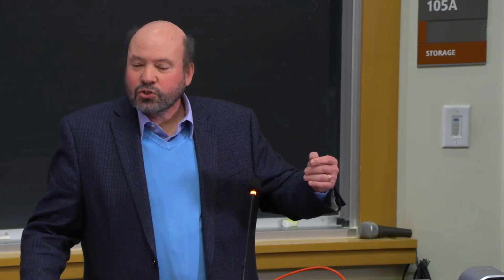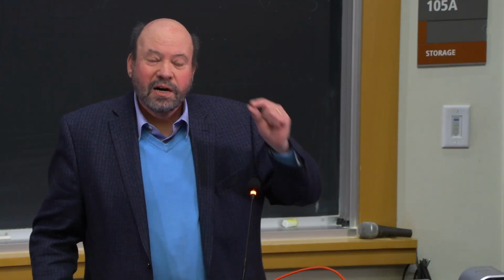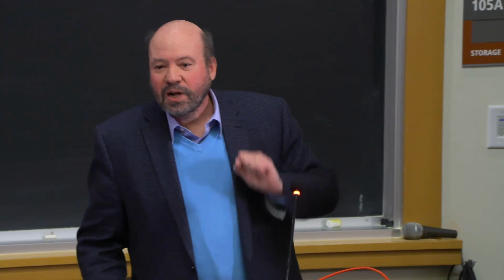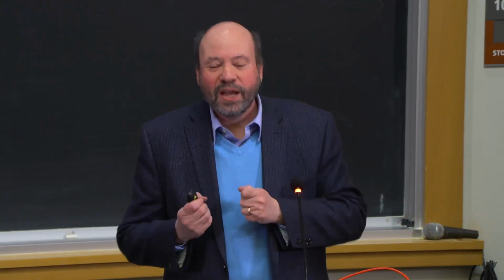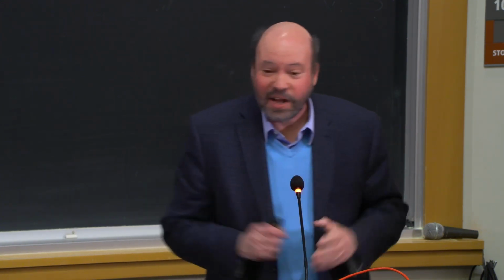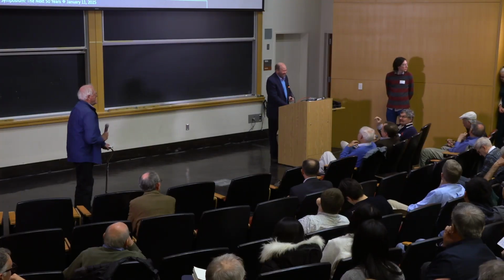But then, I think, it does turn out in the end that a thinner sensor actually can do better. But the idea of thinking about the microscope in a way, how can we optimize it for detection, is absolutely a valid idea still.